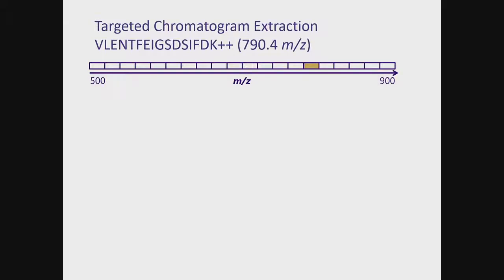So if we think about this, the way that we actually use this data isn't to tell us what types of things we can identify, it's to tell us what sort of things we can detect. So we'll often start with some sort of hypothesis, saying, can we detect this target peptide? And it could be this target peptide and 1,000 others. But in general, we approach this question in a very targeted way, saying, can we measure this specific peptide?